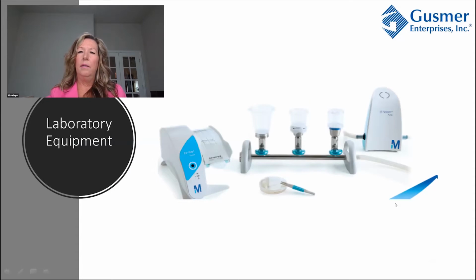Okay, this slide is some equipment that we sell. And what I think is most important about this slide for you guys is that you are able to sample 100 mils of either wort or beer at a time. In a general micro setting without this equipment, you could only sample 1 mil at a time. And so you're getting a very large sample size. This is the pump here. This is the manifold. And these are some disposable funnels that we sell. And then this is just a dispenser for the membranes.